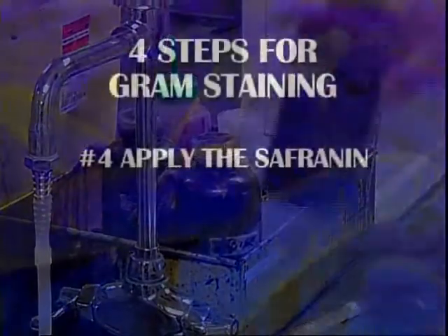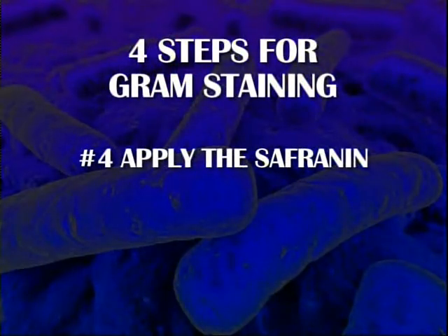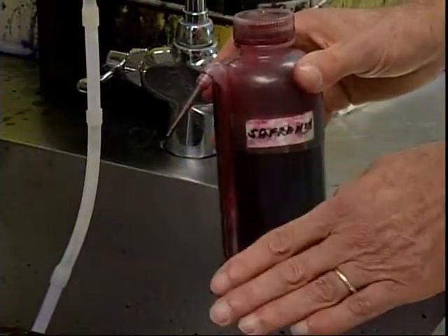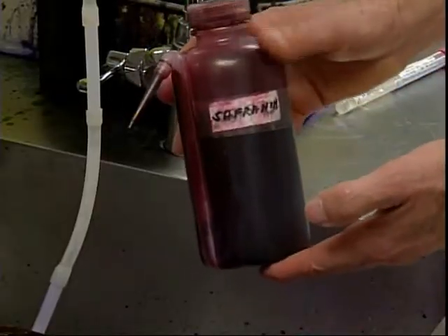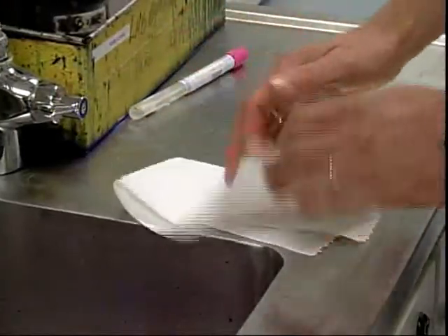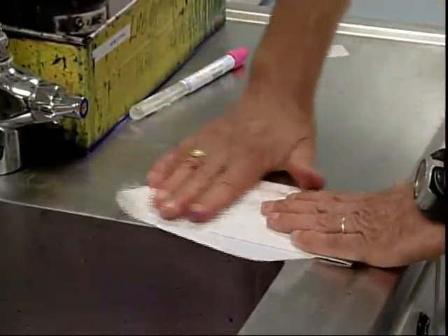So for them, we add the final procedure and the final stain, and that's safranin. So what's left on there are gram-negative organisms, and they'll be stained with a safranin stain. That goes on for a few seconds. It's rinsed off. We blot it dry, and it's ready to be examined.